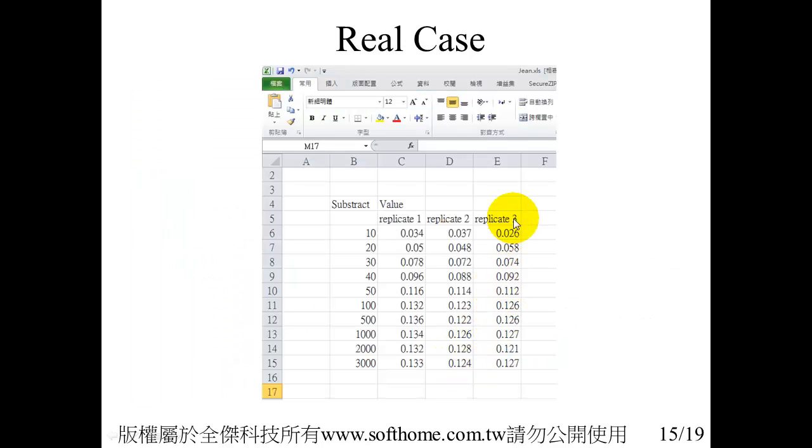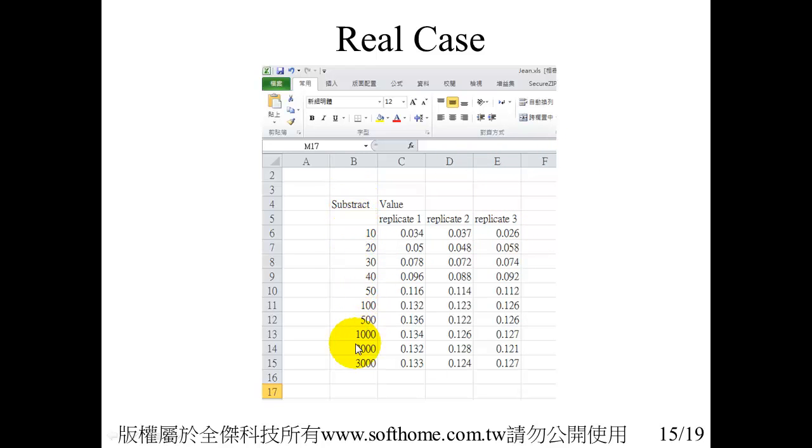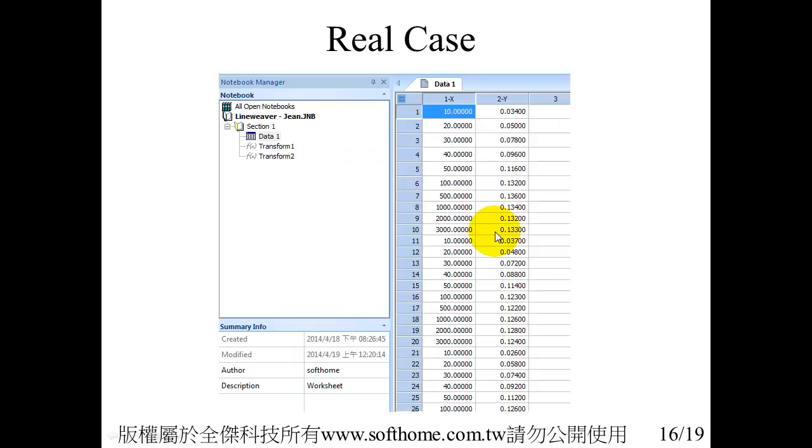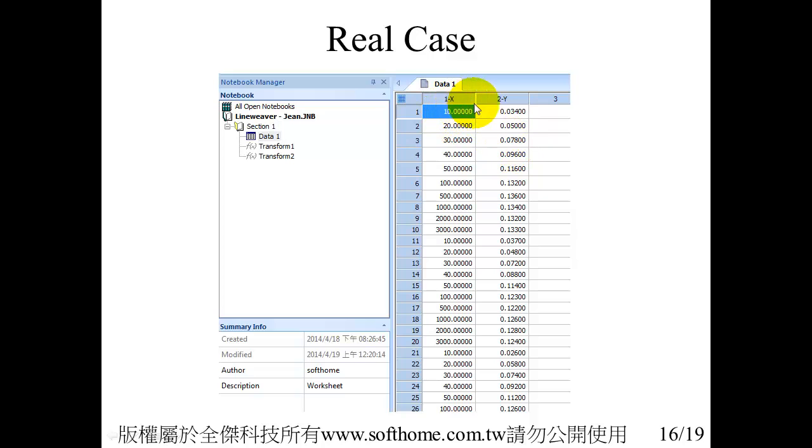If we use the real case, the structure here has three replicates. But in our data input, you must rearrange your data into two single columns. First one is for X and second one is for Y. For regression, the result is completely the same.